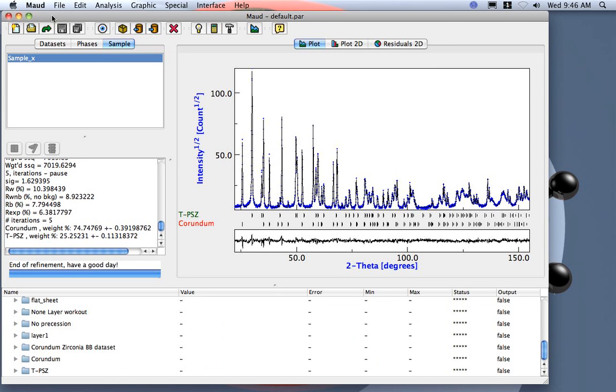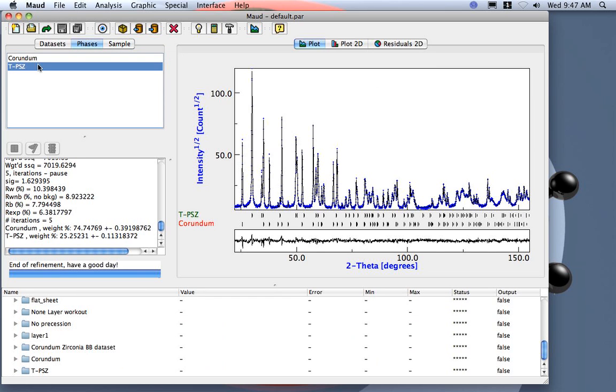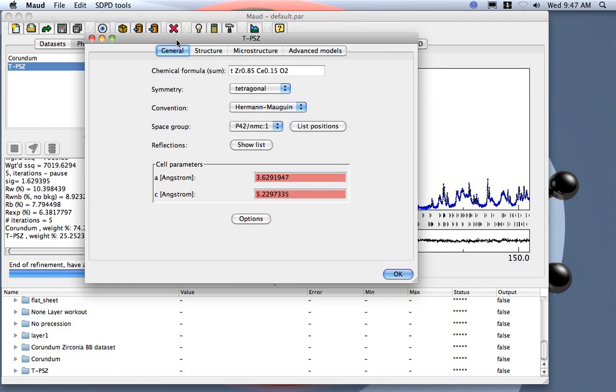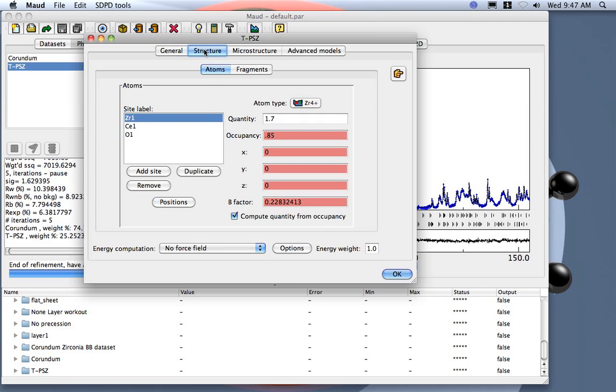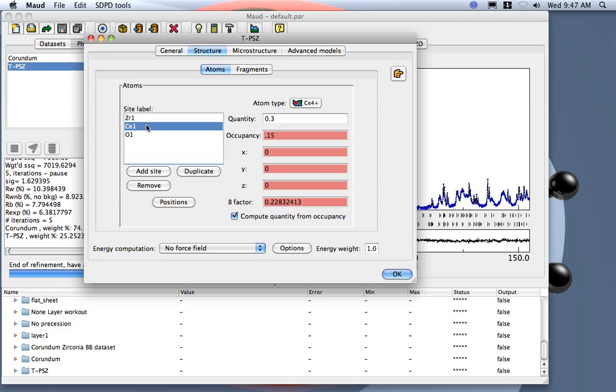Now another thing to note is that the tetragonal zirconia, we just changed the cell parameters but we didn't change the composition. In reality, the composition is not 85-15 for zirconium and cerium but is actually 82-18. So in principle, to get a better refinement, or more accurate results, we should also change the zirconium and cerium ratio. You can check here if you look at the XYZ coordinates.